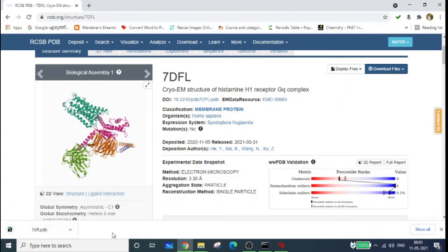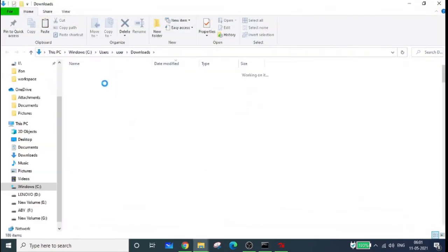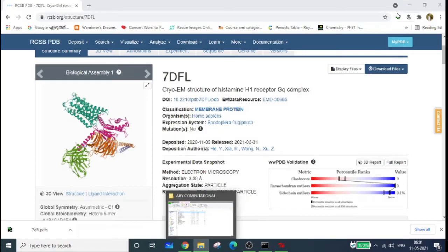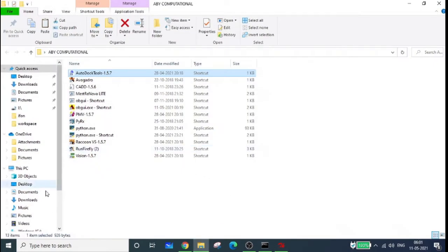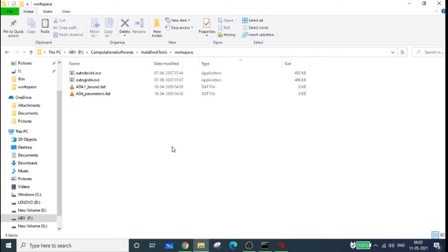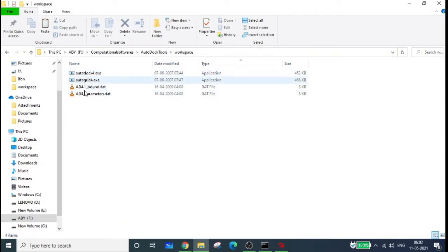The file is now downloaded. As mentioned in the last video, whatever molecule you're taking to AutoDock you have to keep it in your designated workspace folder. In my case, I created a folder called 'workspace' located at F:/Computational Software/AutoDock Tools/workspace. Copy the downloaded file from your Downloads folder and paste it into the workspace. The workspace folder should contain these four files.